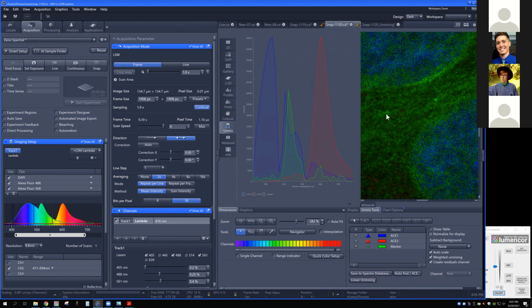One of the things that you try to do, if possible, is to have fingerprints that are roughly equal in signal strength. If you have one that's very weak compared to the rest, especially one that's sinking into the noise floor a little bit, that one is going to struggle in terms of being able to tease out your signals properly. So it's a good idea to try to have fingerprints that are roughly the same strength. And what that means is I could even pick regions that are a little bit weaker in red and weaker in blue to try to match what I'm considering my brightest green signal here, if I wanted to.